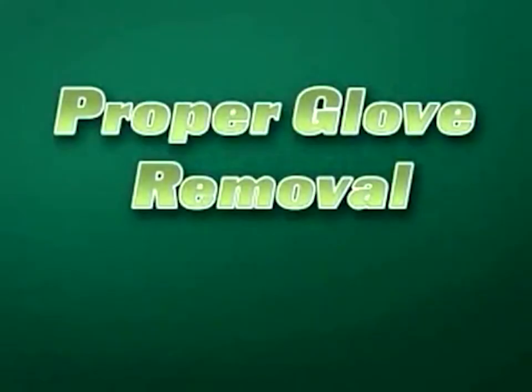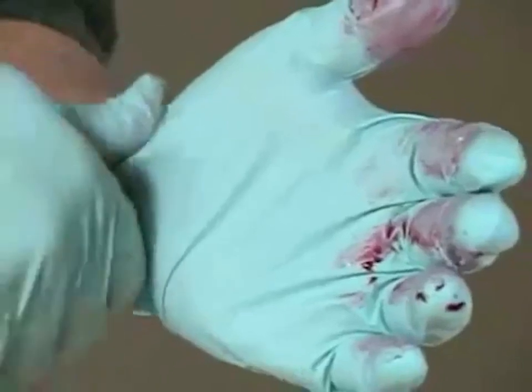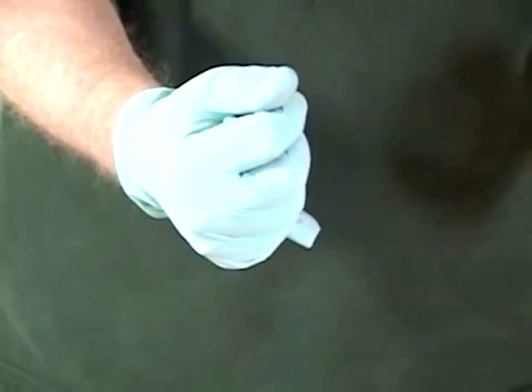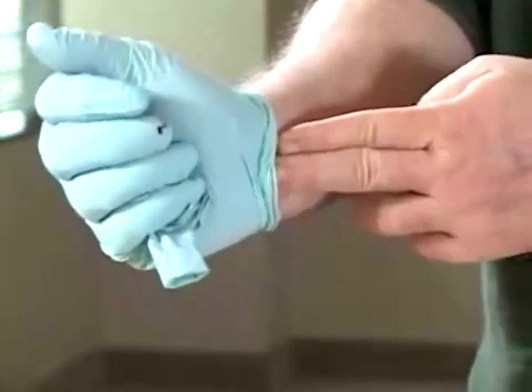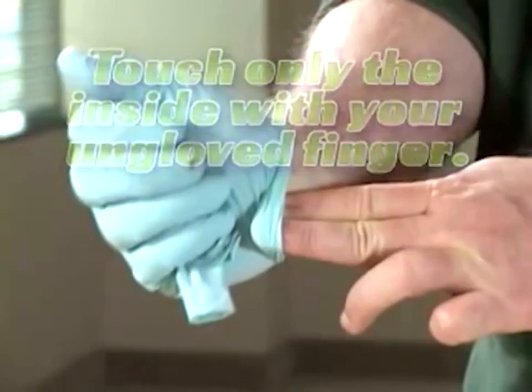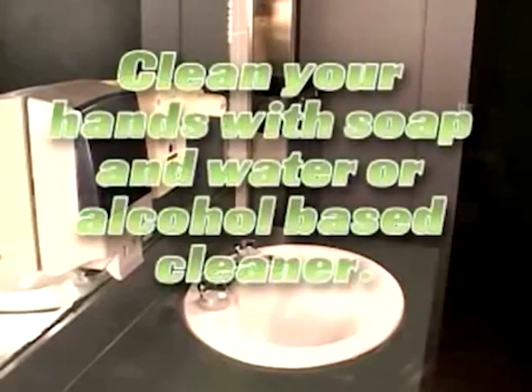Proper glove removal. Follow these steps to prevent the spread of pathogens. Pinch the first glove at the wrist and pull down, touching only the outside of the glove. Ball up the removed glove in the palm of your gloved hand. Slide an ungloved finger inside the other glove, touching only the inside with your ungloved finger. Peel the second glove off inside out, trapping it in your palm. Discard the balled up gloves in the proper receptacle. Clean your hands with soap and water or alcohol-based cleaner.